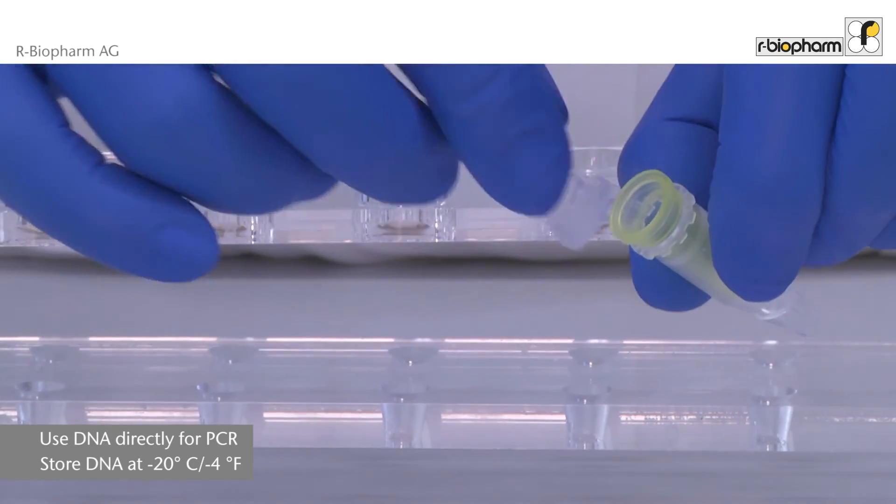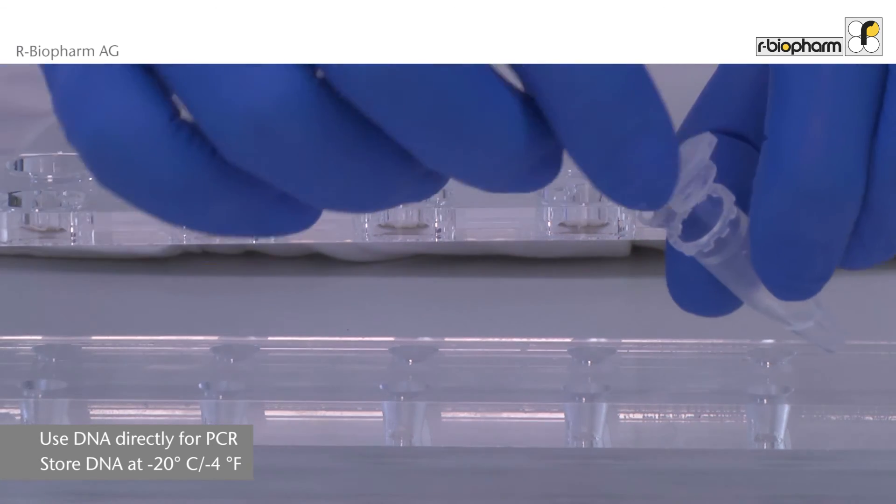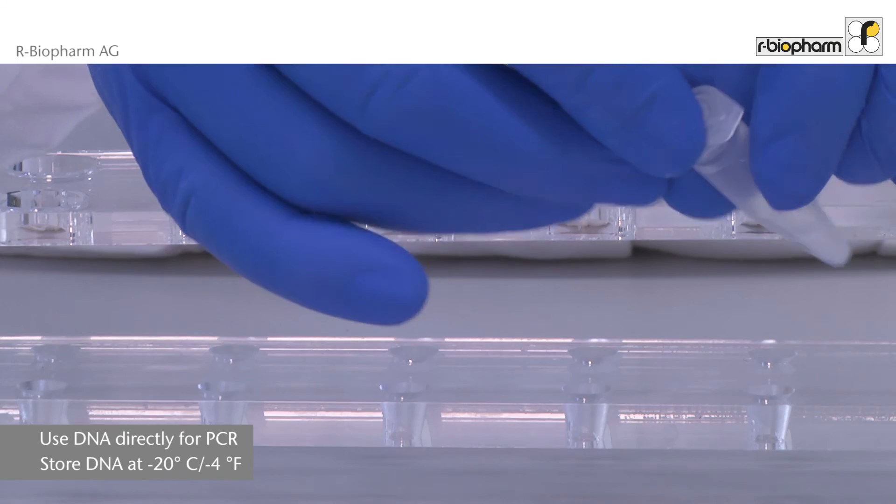Discard the spin filter. The DNA in the reaction tube can be used directly for PCR, or store the DNA at minus 20 degrees centigrade.